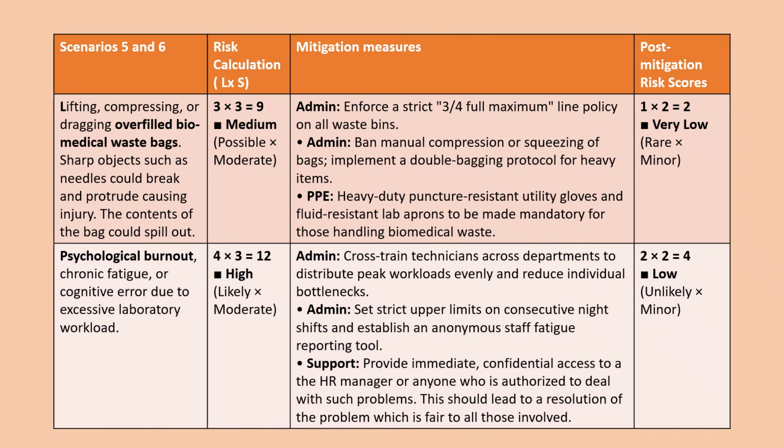The next scenario is lifting, compressing or dragging overfilled biomedical waste bags while they are being transported. Sharp objects such as needles could break and protrude, causing injury. The contents of the bag could spill out. The risk calculation for this is 3 into 3, which equals 9, medium risk.